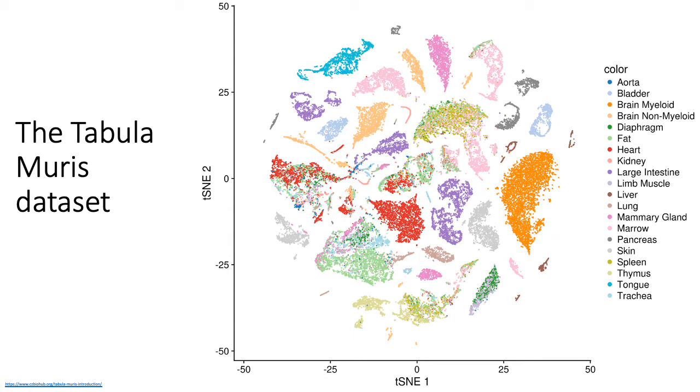because cells group together when they exhibit similar expression profiles. And so this visualization is essentially a starting point from which you can, for example, identify candidate cell types, and then identify, for example, cell markers or signature genes of each cluster by taking each individual cluster and, for example, doing differential expression tests to try to figure out which set of genes are uniquely expressed in one cluster of cells compared to all other ones.